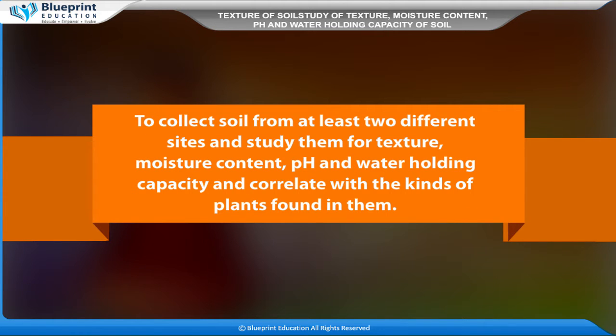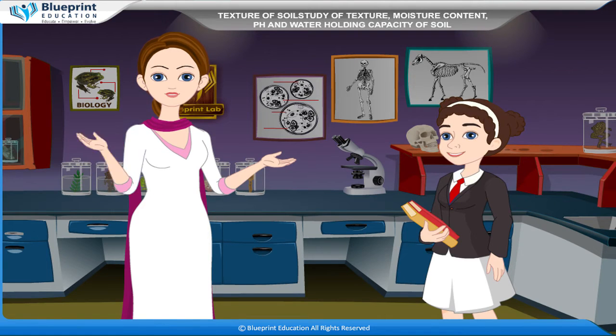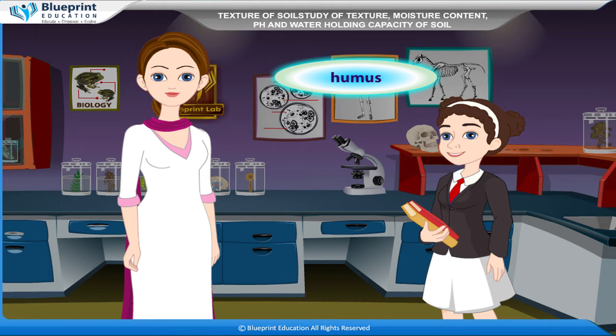To collect soil from at least 2 different sites and study them for texture, moisture content, pH, and water holding capacity and correlate with the kinds of plants found in them. Soil is the upper weathered layer of the Earth's crust consisting of minerals and organic matter called humus.